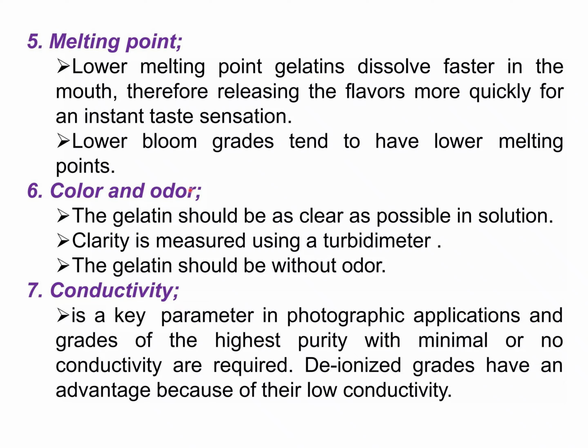The next one is color and odor. Gelatin should be as clear as possible in solution. Clarity is measured using a turbidimeter. The gelatin should be without odor, because gelatin can have a very bad odor since it's derived from skin or several other parts of the animal body.